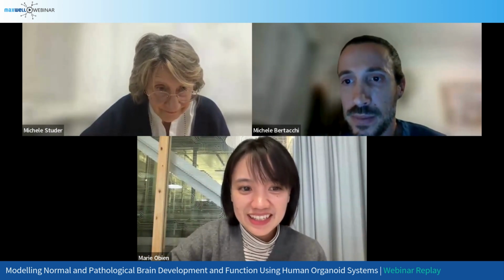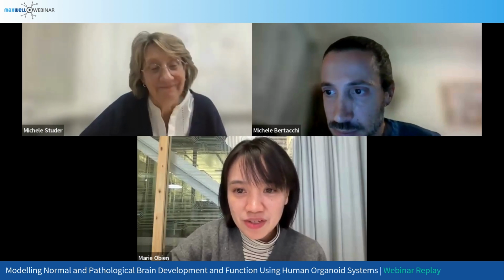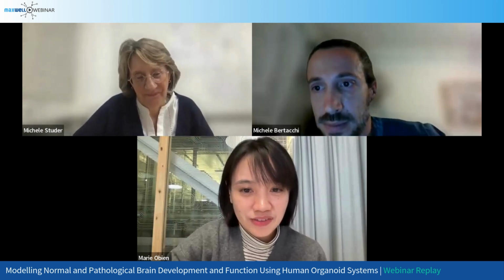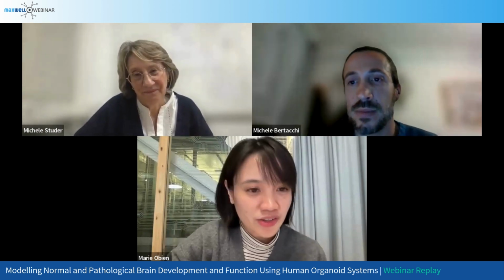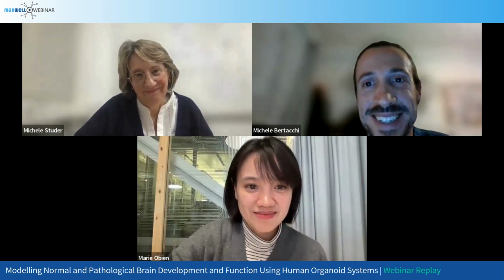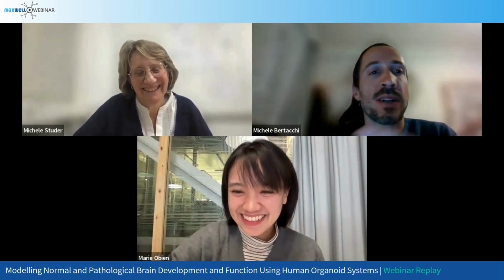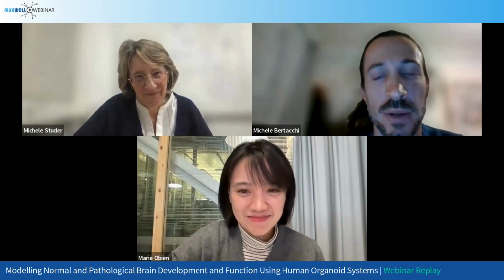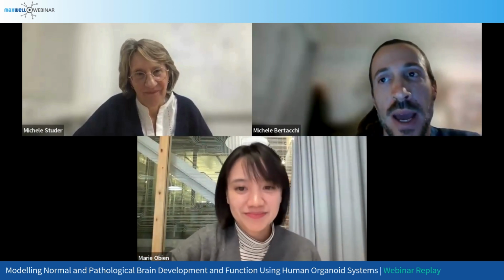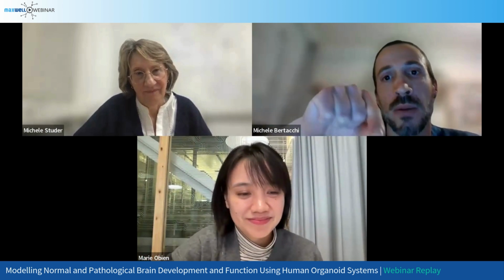Thank you. So JP, in the MEA results, you see most of the activity in the axons elongated from the organoids. Do you think this is representative of the whole organoids network activity? Thank you. We always get this question. Well, the recording is by definition 2D, right? Because you're recording from the surface of the chip. And in our case, it's also really all around the organoid.